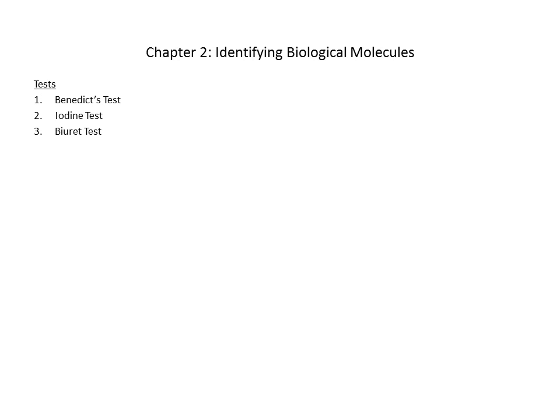So you have to be able to see a picture of one of these tests run and say, oh, that's a positive reaction or that's a negative reaction. And then most of the questions are actually going to be about interpretation, such as you see a positive test for Benedict's but a negative test for iodine. What does that tell you about the thing you're looking at? And there is an answer to that. Hopefully think about it, and I'll leave a note at the end of this presentation when we're done with it.